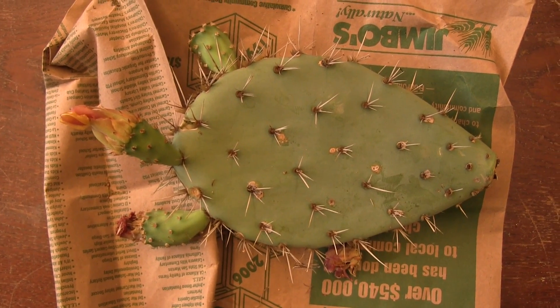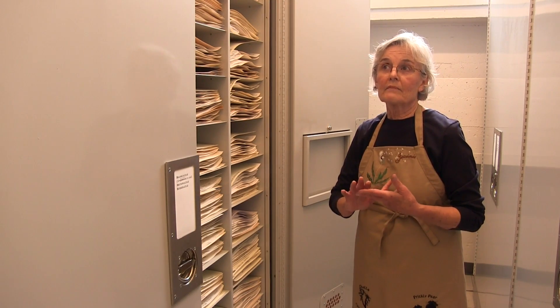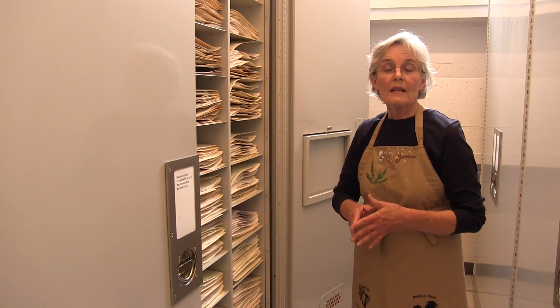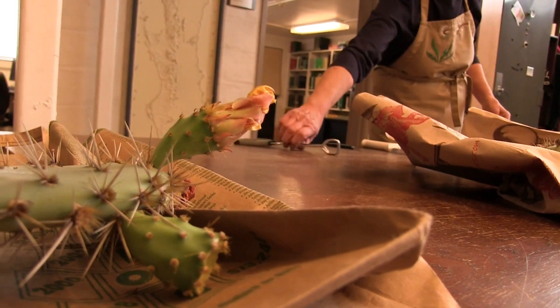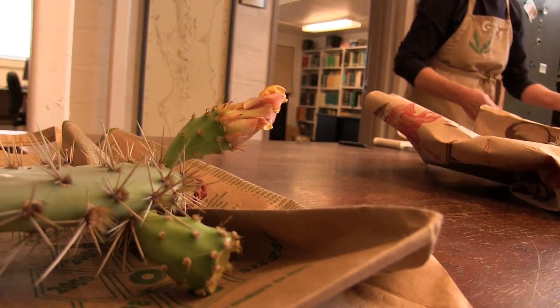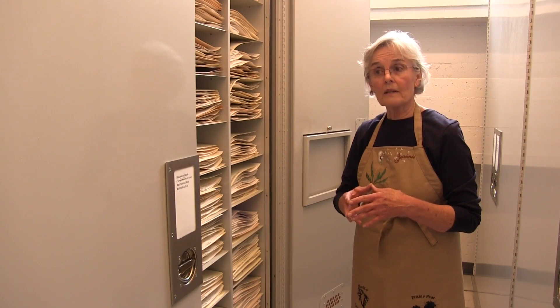The difference between cactus and the other things that would come in, say a grass or a sycamore tree or whatever, is that they are essentially dry. They're not full of moisture and they're not too thick and they will dry without molding.